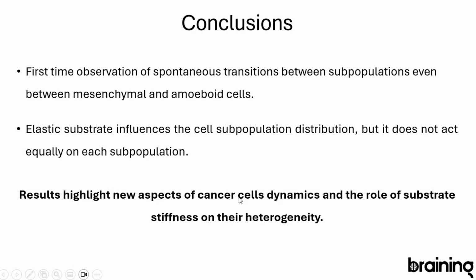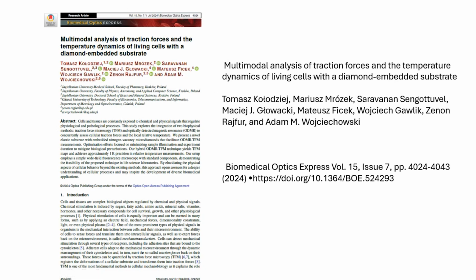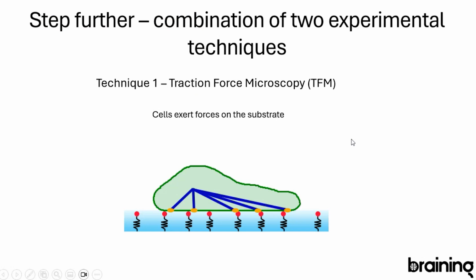And because we didn't stop here, we are really curious people, and we like hard problems. So Dr. Kawajay moved one level up. Now he wants to combine two techniques which are used in the measurement. So we have the elastic substrate. The previous work was very simple. We just showed how the cells behave on the elastic substrate.